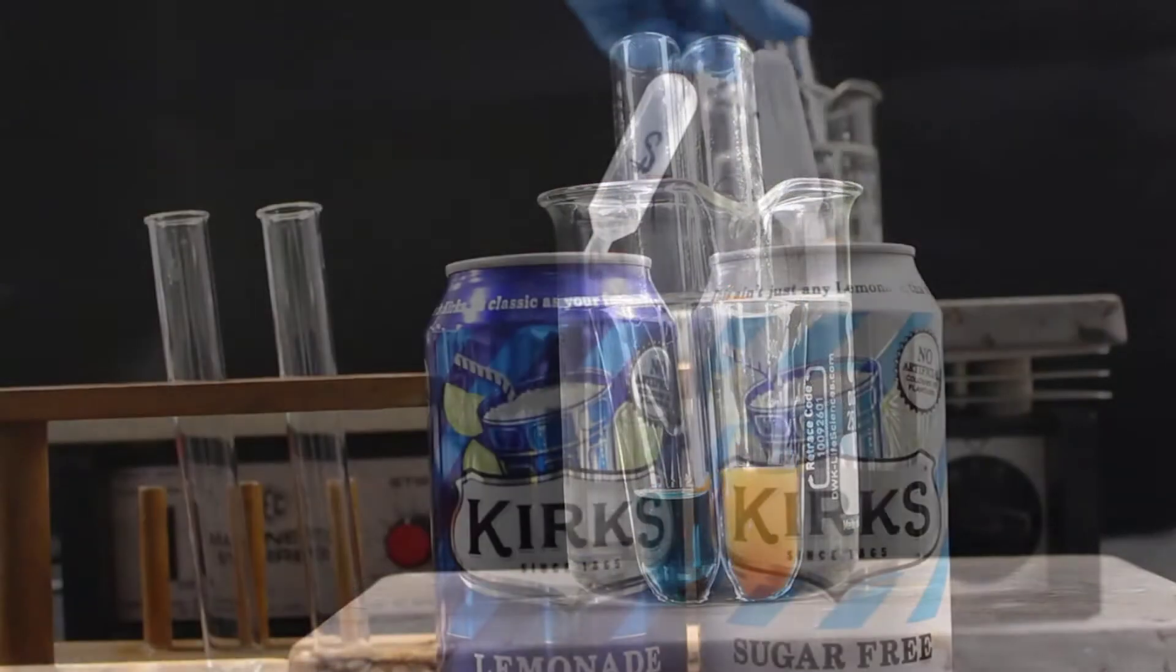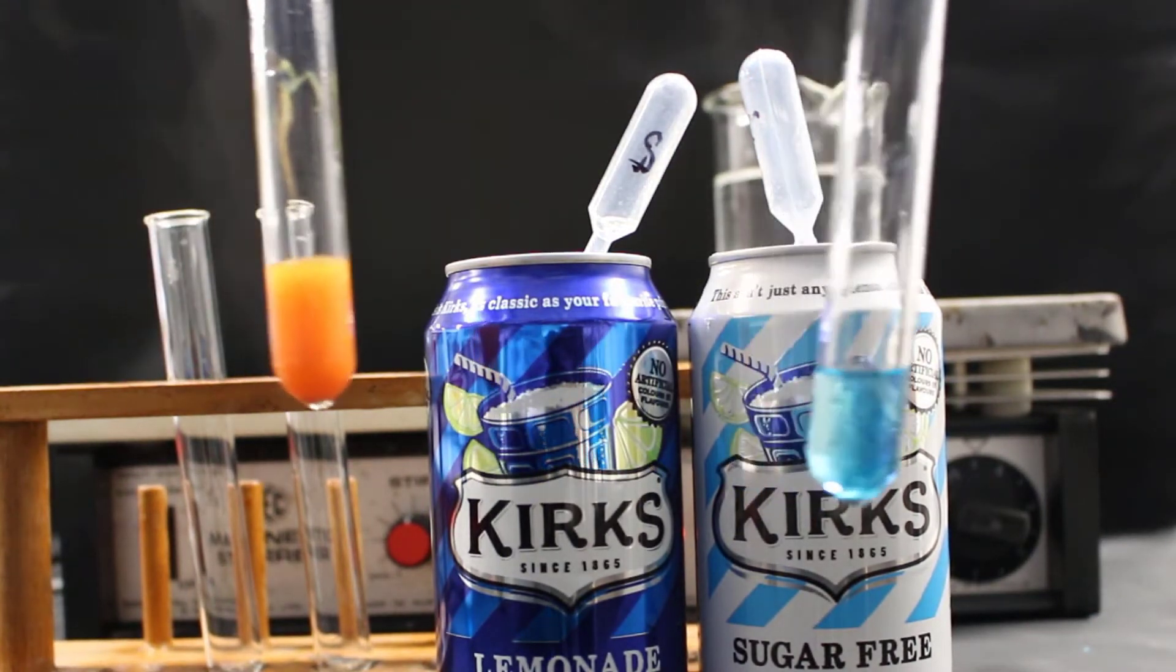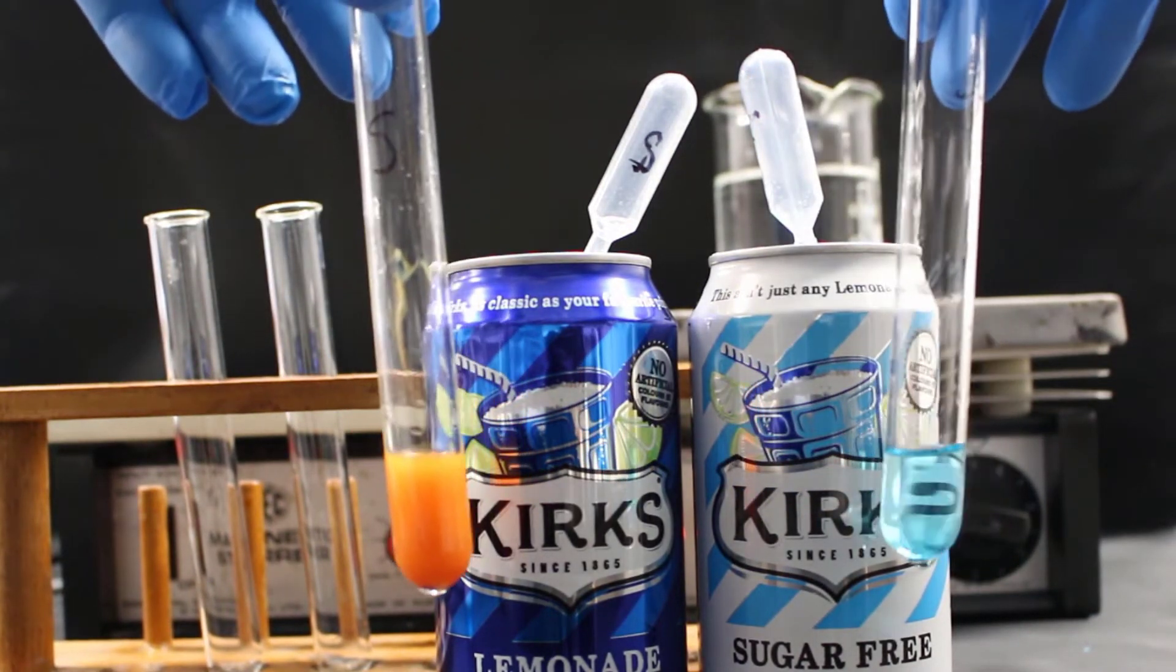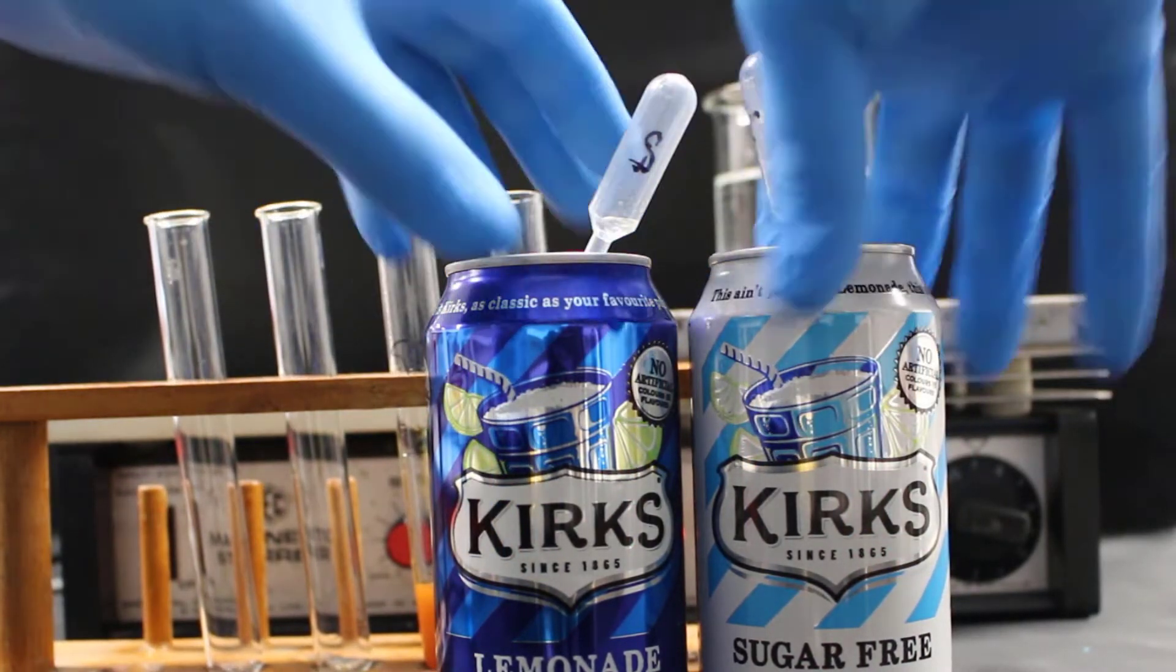The positive result for the Benedict's Test is a red brick or bright orange color. So as you can see, the sugar lemonade contains glucose and the sugar-free lemonade contains no glucose.